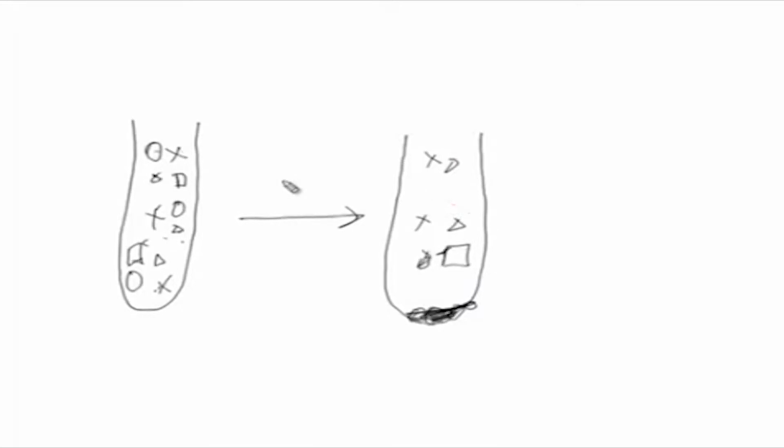So, why do you get partial purity? When a centrifugal field is applied, different molecules will sediment at different rates, but these molecules are homogeneously distributed all over the tube. A molecule which is here will experience a particular force, and the molecules which are already present at the bottom will also experience certain force.